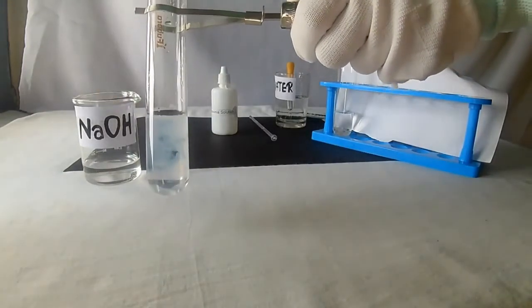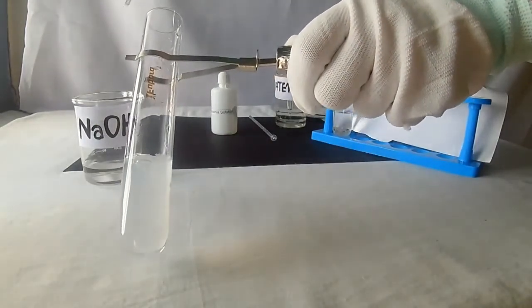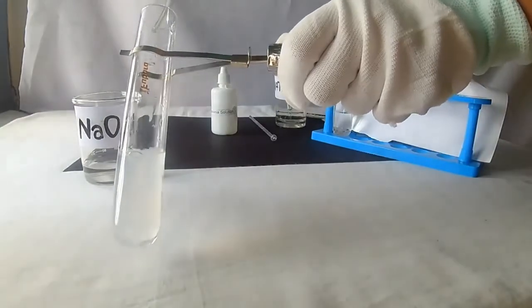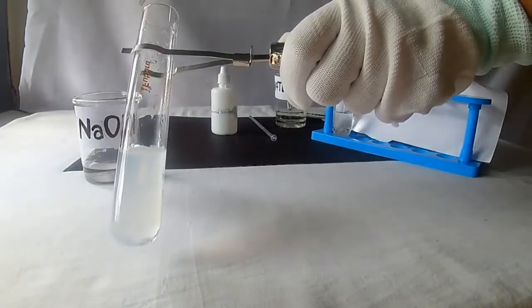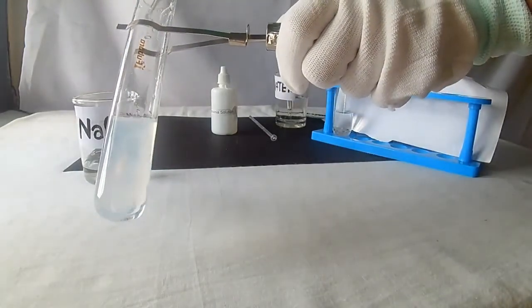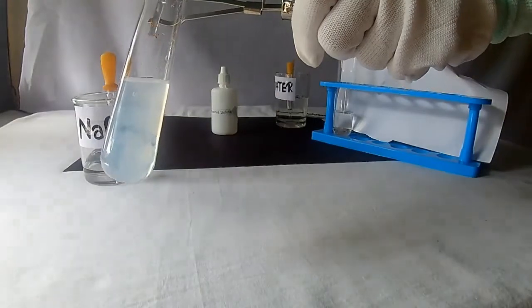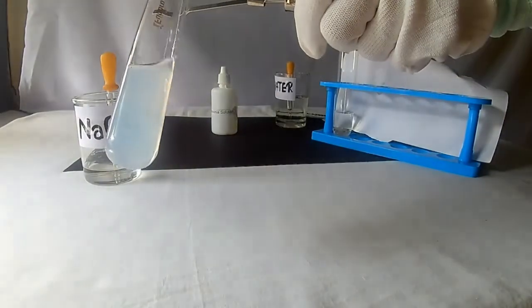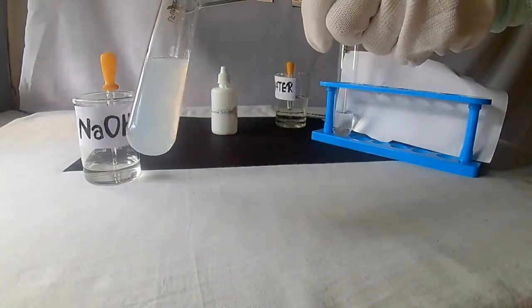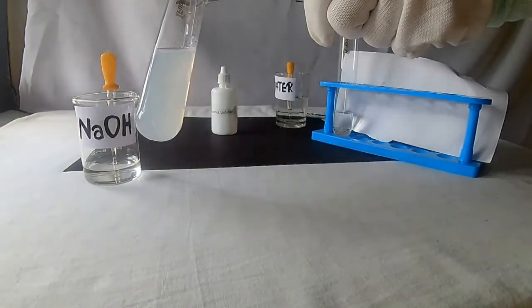Now add sodium hydroxide in excess. It slowly dissolves. Stir it and check whether the salt dissolves. Yes, it dissolves.